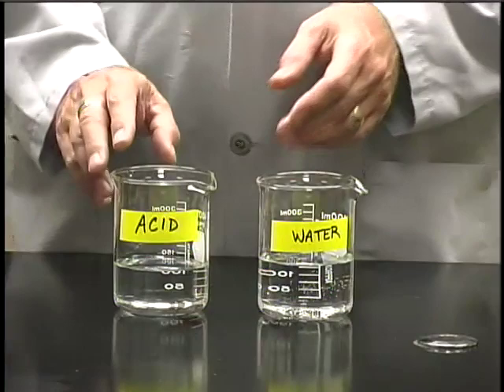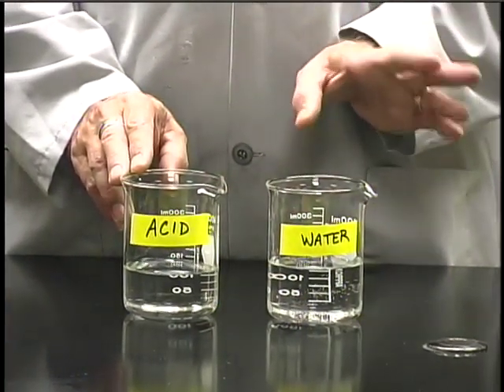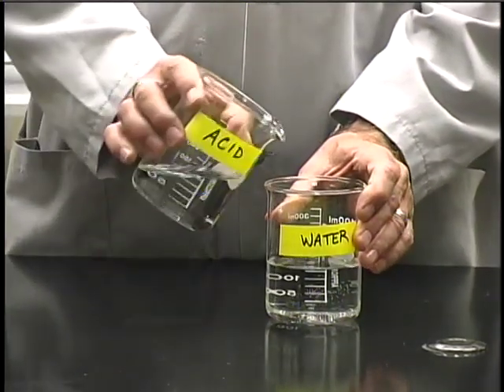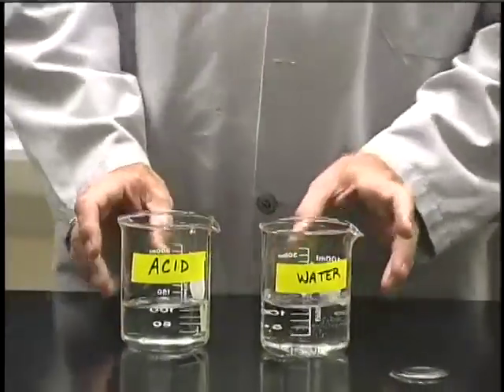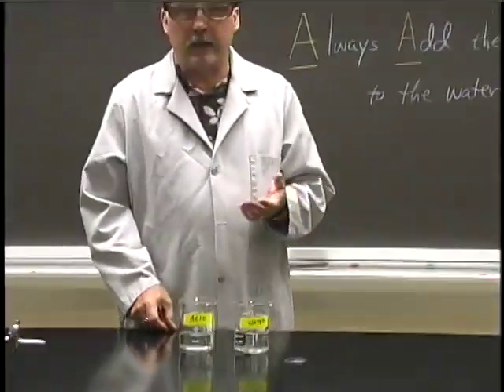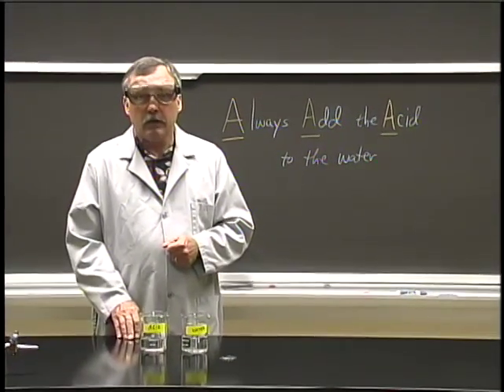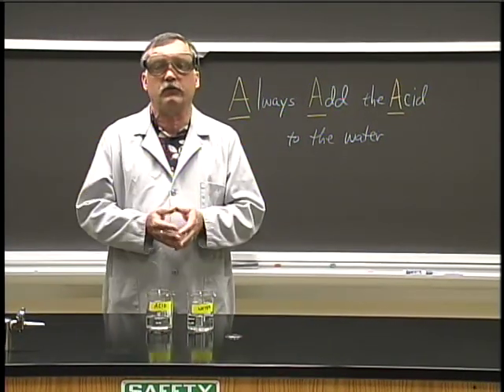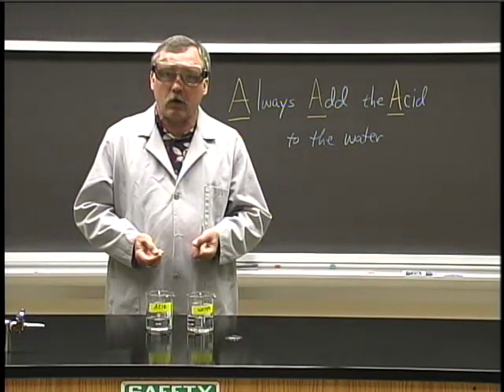When you need to combine concentrated acids and water, it's very important that you remember the following safety rule: you must always pour the acid into the water, never the water into the acid. The reason for this is that if you pour the water into the acid — the incorrect way — the first few drops of water instantly turn to steam and spatter violently, spraying acid back all over you.